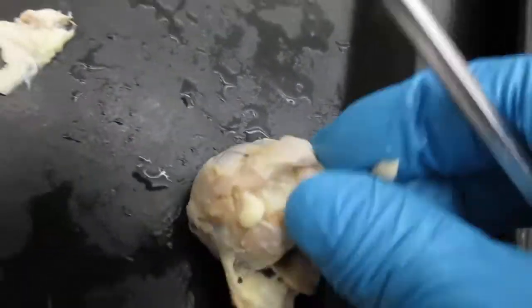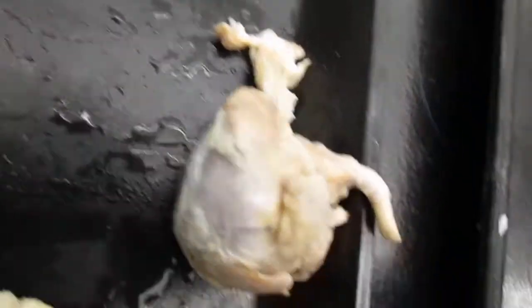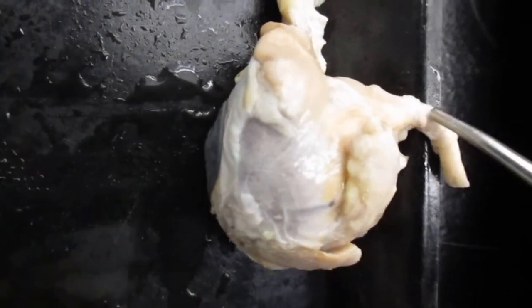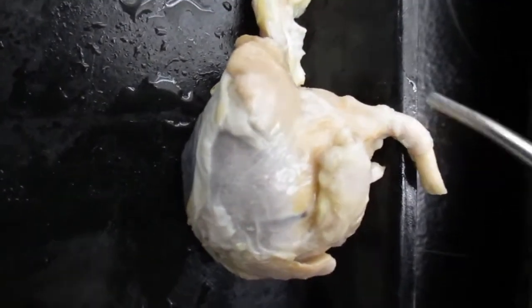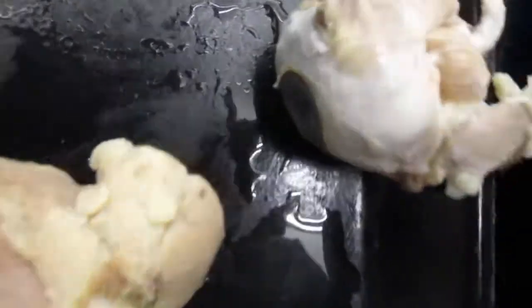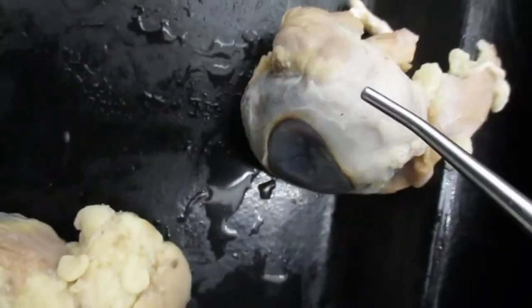So this structure right here, that's your optic nerve. Your optic nerve is right there. Okay? And then this right here, remember, extrinsic eye muscle.